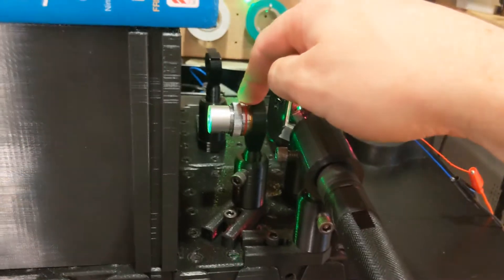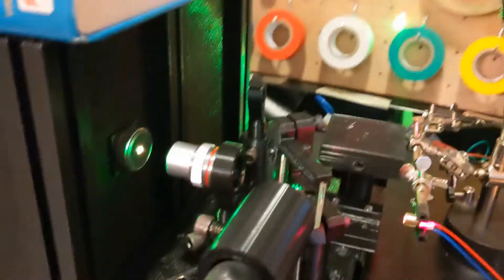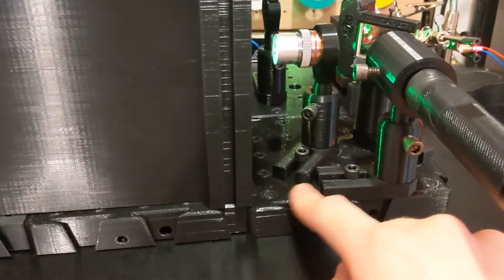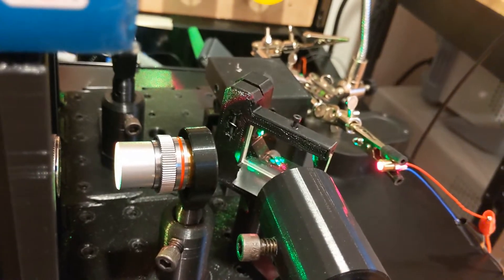Right here is the lens to focus the light into a slit. The green and red are mixing in there and it kind of looks yellow — it's a 5050 beam splitter, so there are two spots going on the back wall. I 3D printed these little breadboard pieces, these post base holders, the posts, and the beam splitter holder.